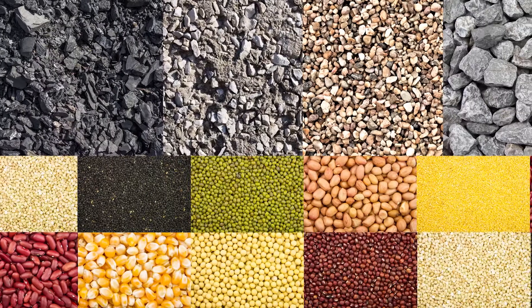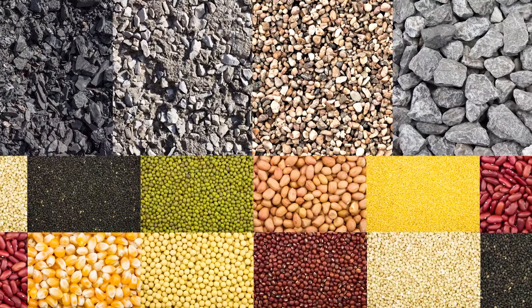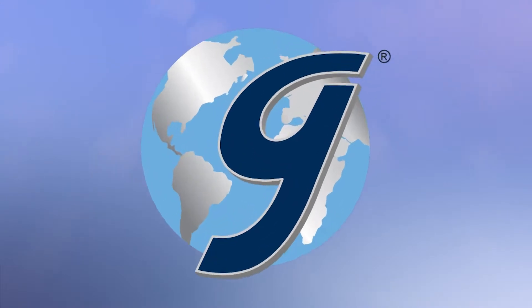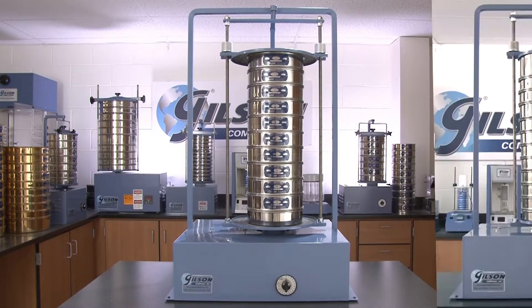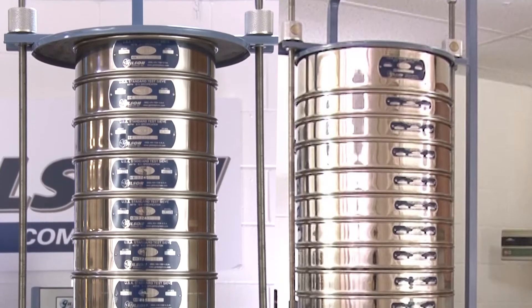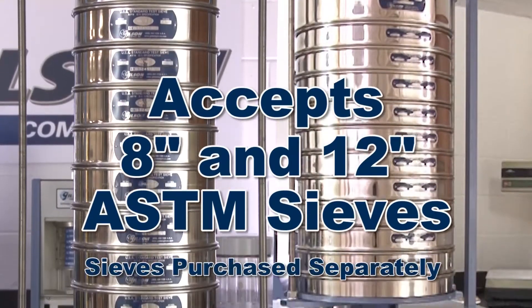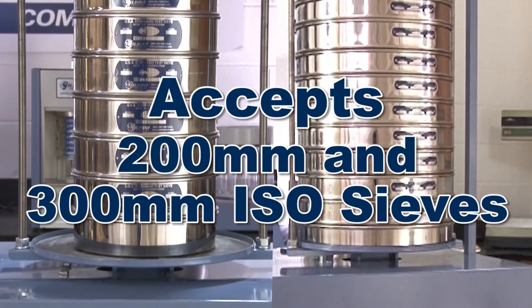When accurate sieve analysis of a broad range of particle sizes and material types is essential, then Gilson is your best choice. Gilson's dependable SS14 and SS14D sieve shakers are designed for maximum versatility and accept multiple sieve diameters including 8 and 12 inch ASTM sieves as well as 200 or 300 millimeter ISO sieves.